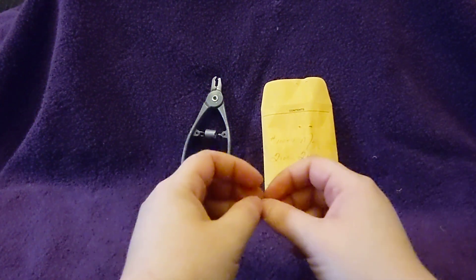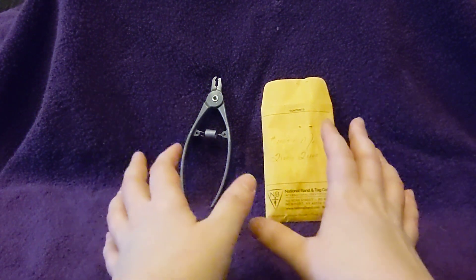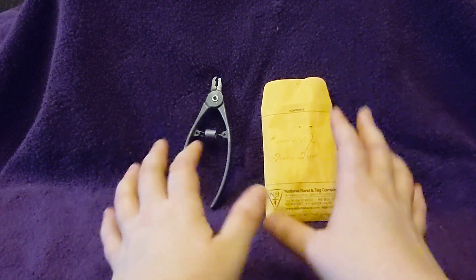Hello. Today we are going to be looking at tagging mice.